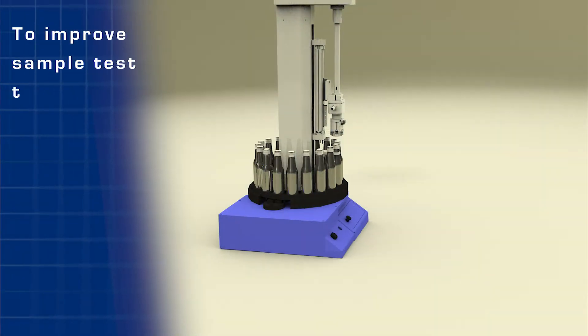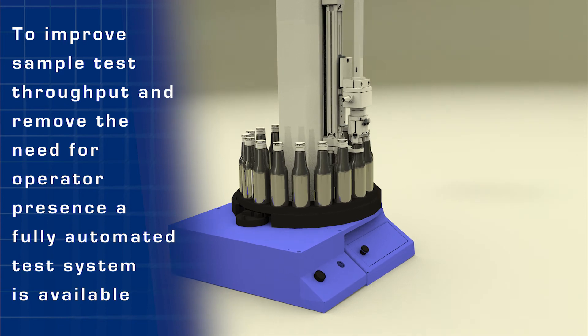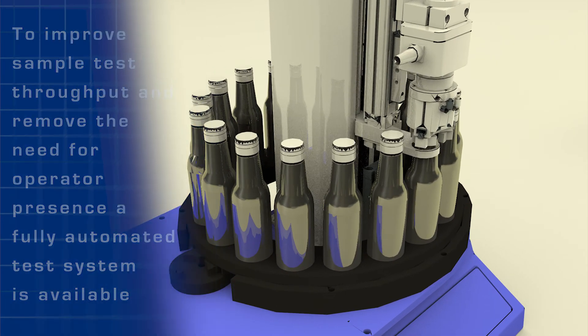And to improve sample test throughput and remove the need for operator presence, a fully automated system is available.